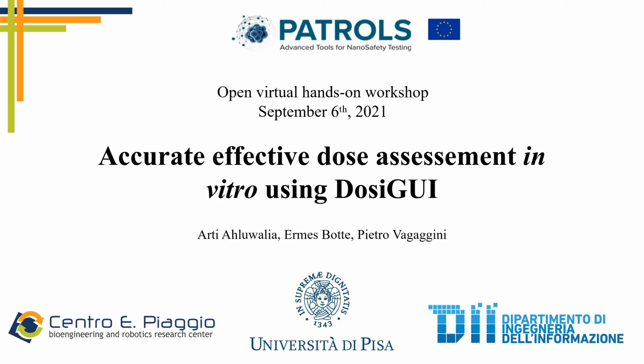So first of all, we will have a brief theoretical introduction to what DosiGUI is and how it can be correctly exploited for this purpose. And then we will hold a hands-on session during which all of you will be invited to run some example simulations and thus learn how to use DosiGUI following our guide with the shared screen.